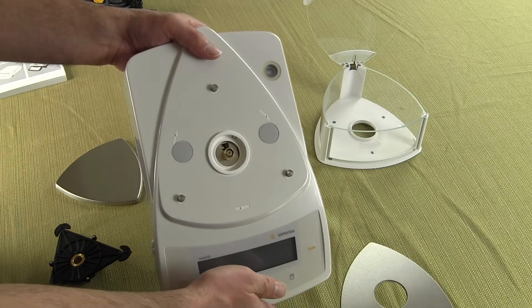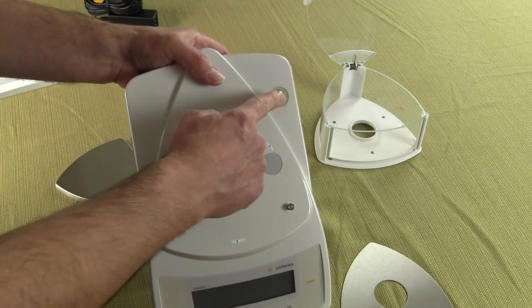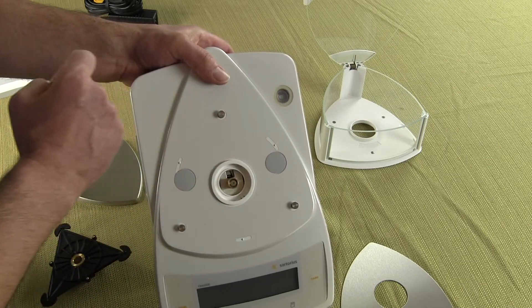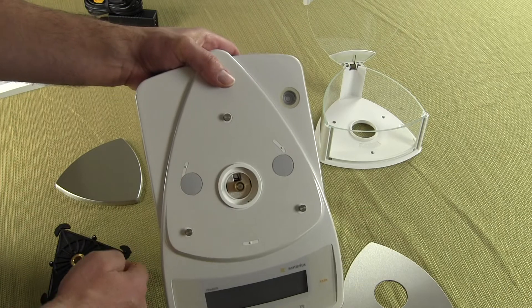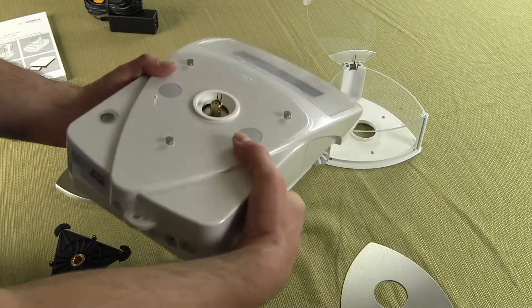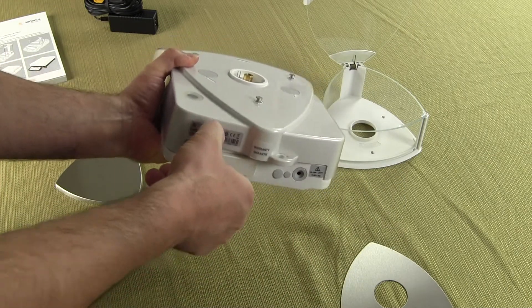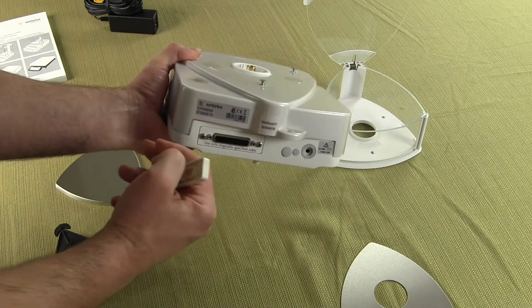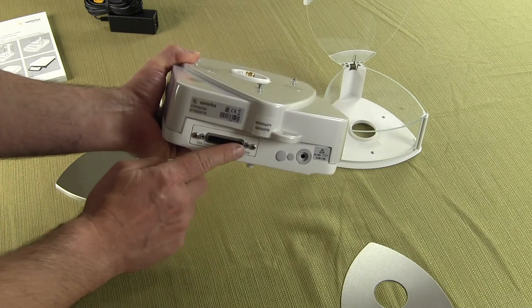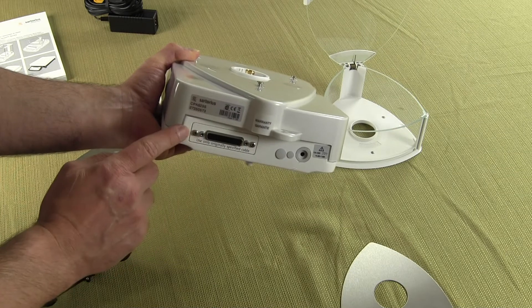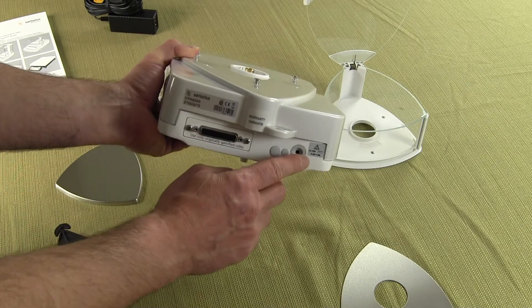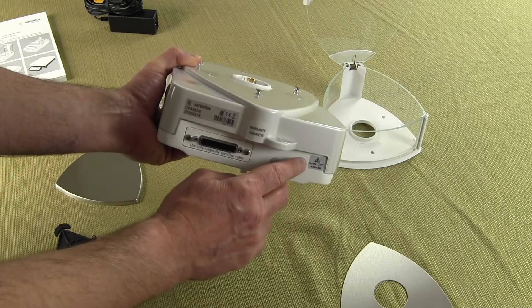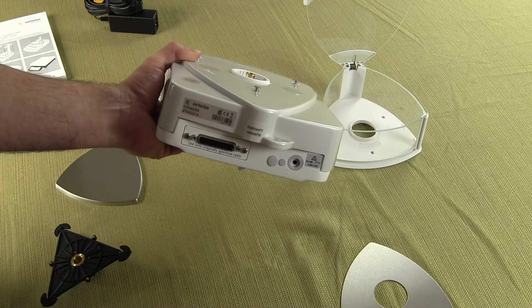So the balance here in the upper right hand corner has a spirit bubble indicator. This is for leveling the balance. And in the rear of the balance we have here this is for an RS-232 interface or a printer. So the Sartorius printer would plug into here or an RS-232 interface. This here is our power receptacle where we're going to plug our AC adapter in.